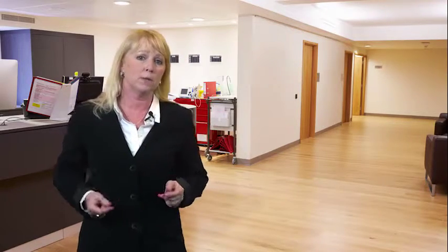There's also biological safety cabinets. These cabinets are designed a little bit differently than that of the laminar flow hoods. They take air into the cabinet through the work surface and recirculate it through a HEPA filter located in the top of the cabinet.